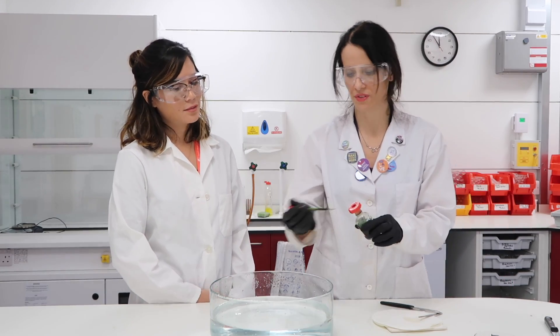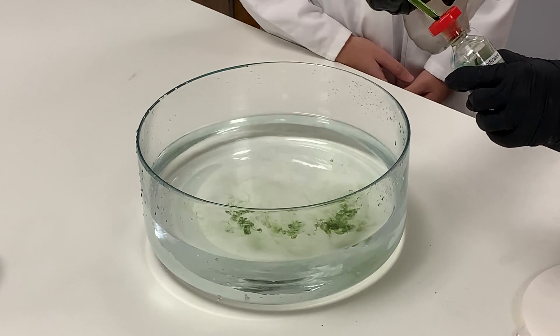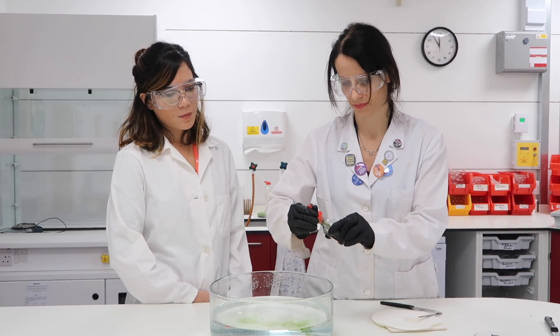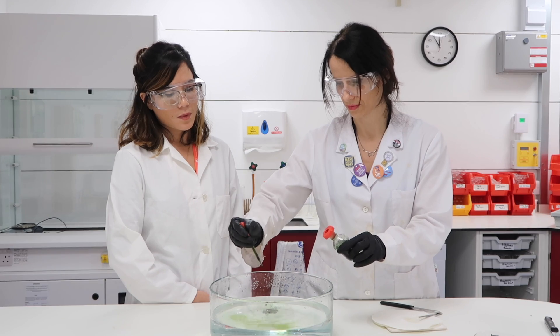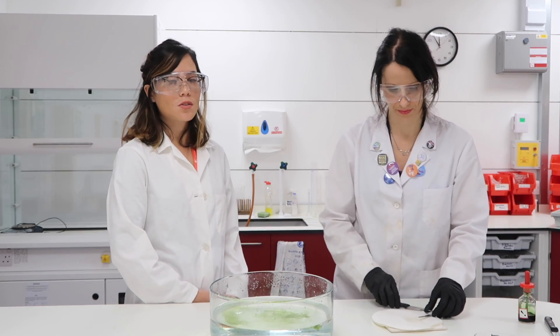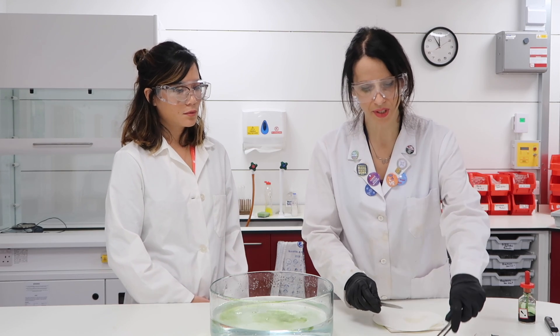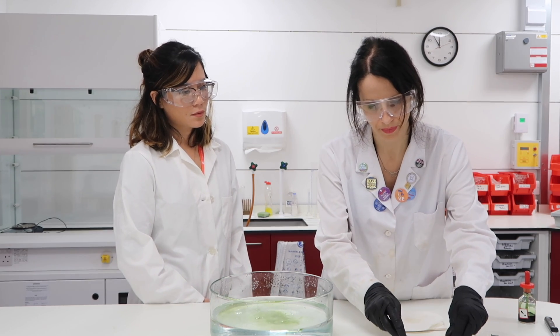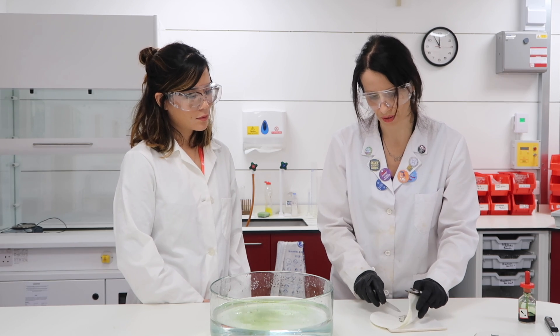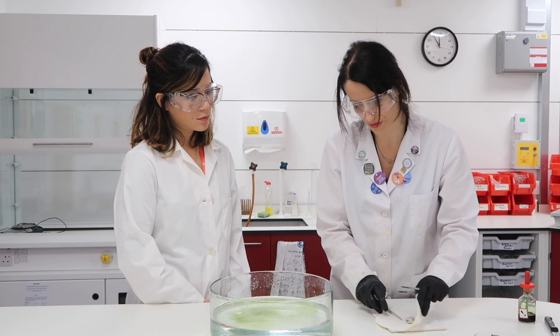I'm going to place some drops of Universal Indicator in the water. Universal Indicator has turned green because water is neutral. Now I'm going to take the potassium, and because they are stored in oil, I'm going to dry off all the oil with filtering paper.